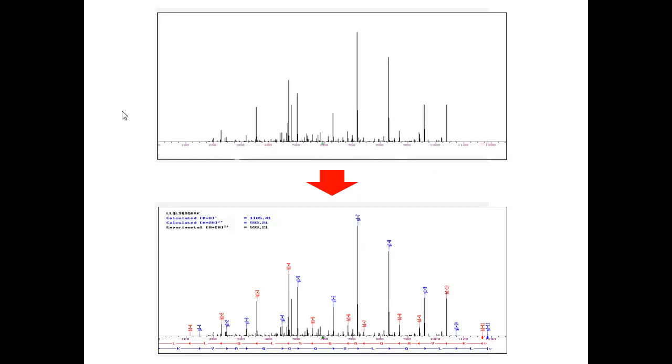At the end of the last video, we had gotten to the point where we had produced this kind of raw data. We had measured fragments of various m/z units, or various masses, and we've recorded them along with some intensity information. The challenge for us now is to get from a raw uninterpreted spectra to an interpreted spectra where we've applied a molecular interpretation based on known proteins, where we identify the peptide that has produced this pattern.